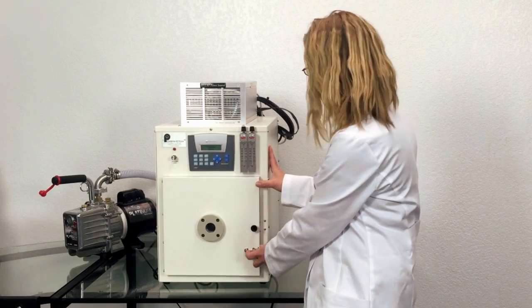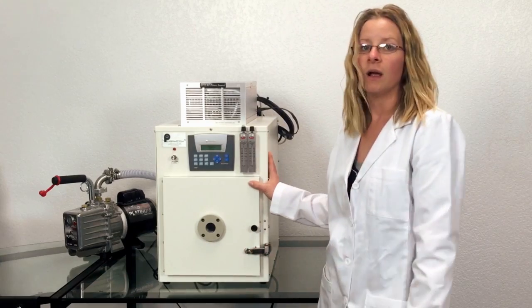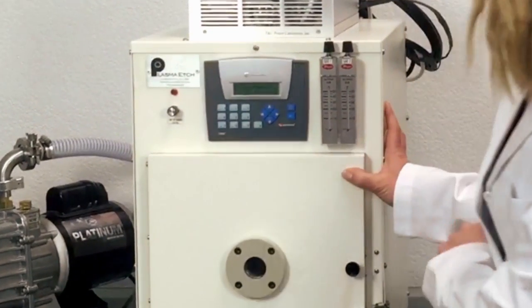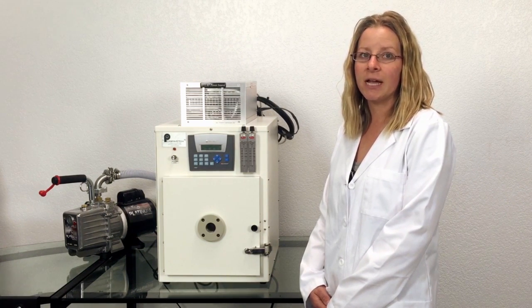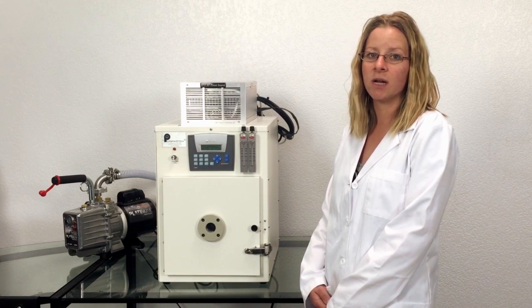Then close the door and use the simple interface to start the plasma sequence. You will hear the pump come on to evacuate the air from the plasma chamber. Once the chamber reaches the desired pressure, usually about 200 mTorr, the plasma sequence will start.